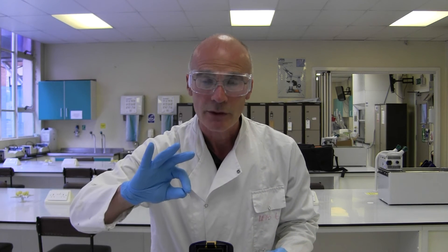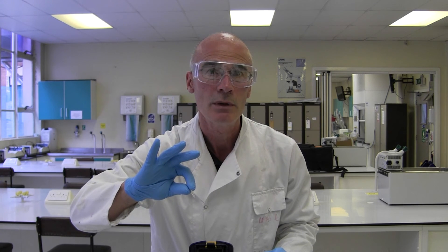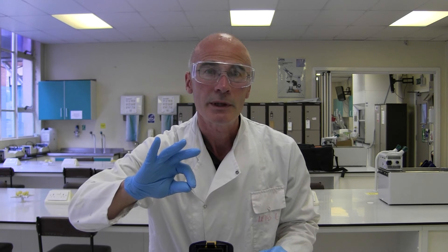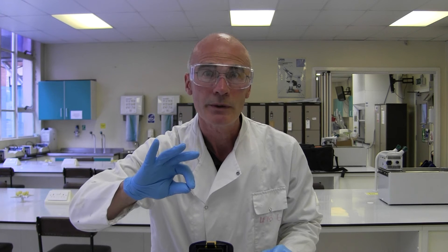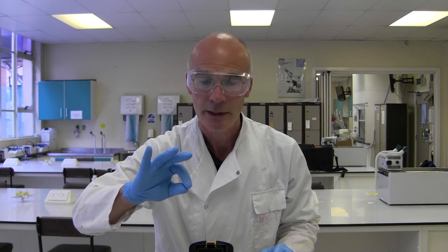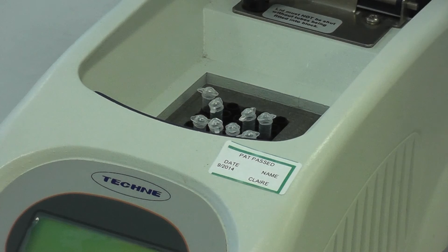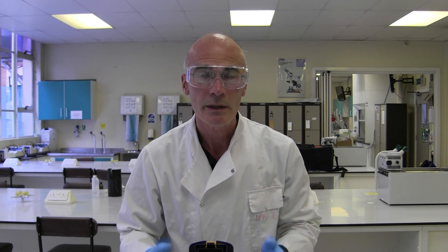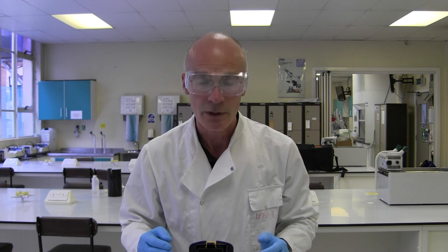You make up the reactions simply by adding your dilute DNA sample and a buffer. The buffer contains the four bases — A, G, C and T — the primers which target the particular region of the DNA you wish to copy, and the Taq DNA polymerase. The tubes are made up and then added to the machine. We can do multiple replicates — in this case we can produce 25 tubes in one experiment, and large machines would take up to 100.